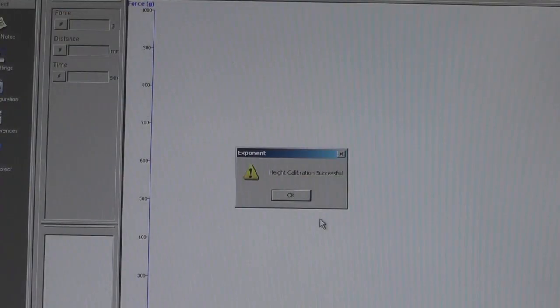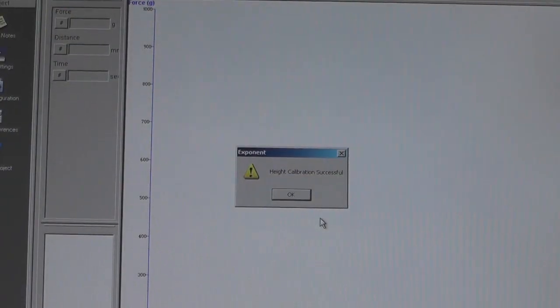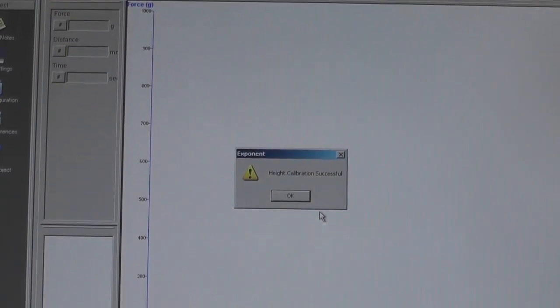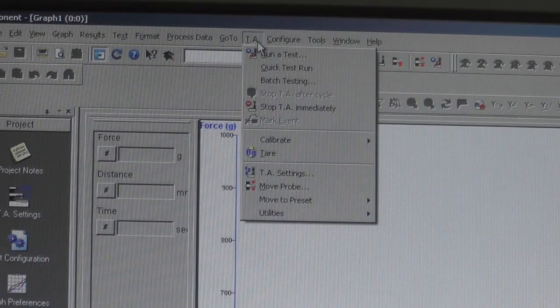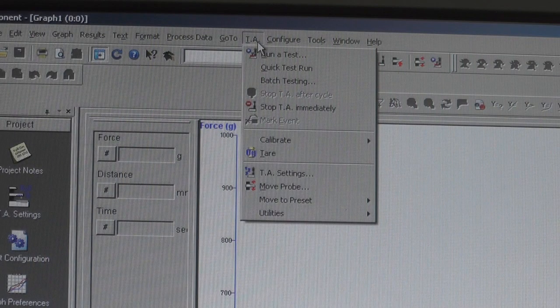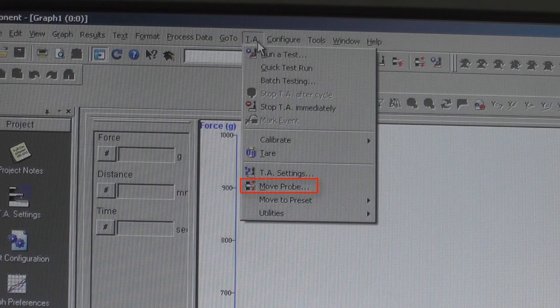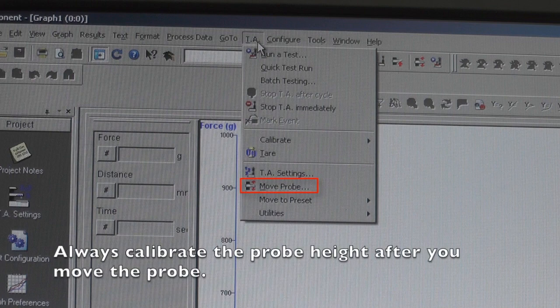When the calibration is complete, move on to the next step. You can always change your probe height by clicking on the TA tab and then Move Probe. But always remember to calibrate the probe height after moving the probe.